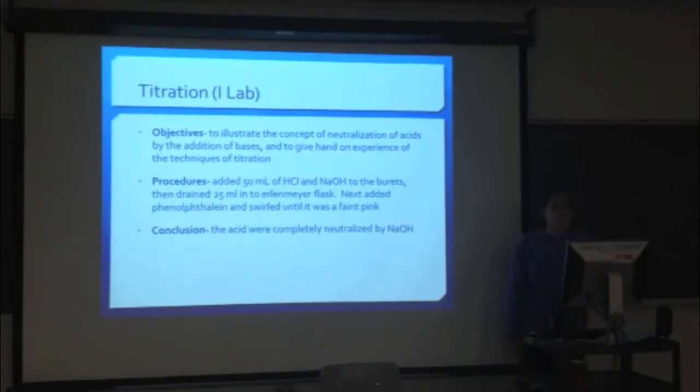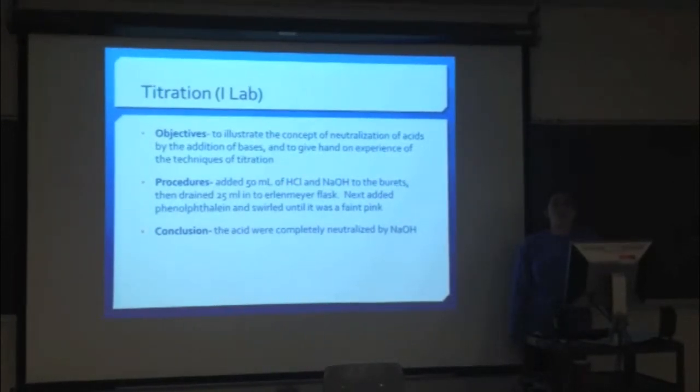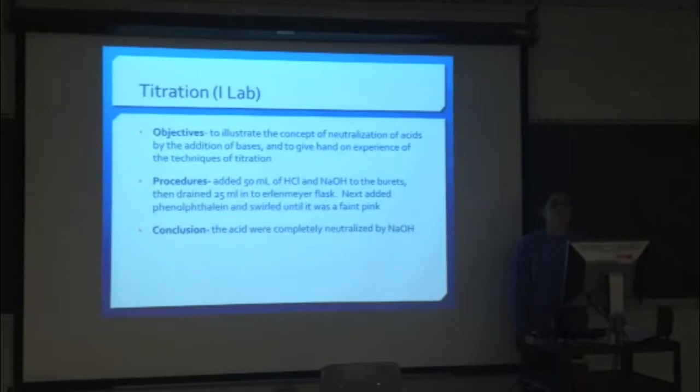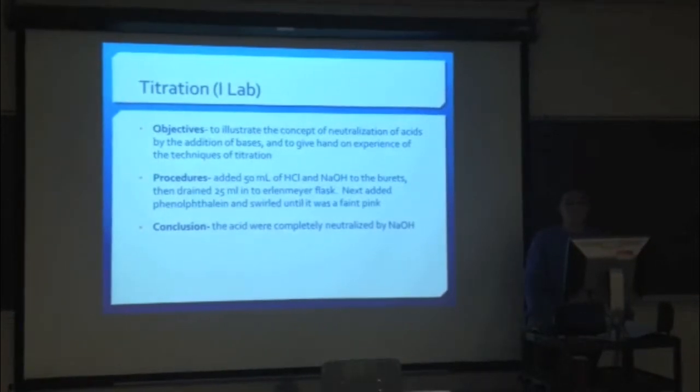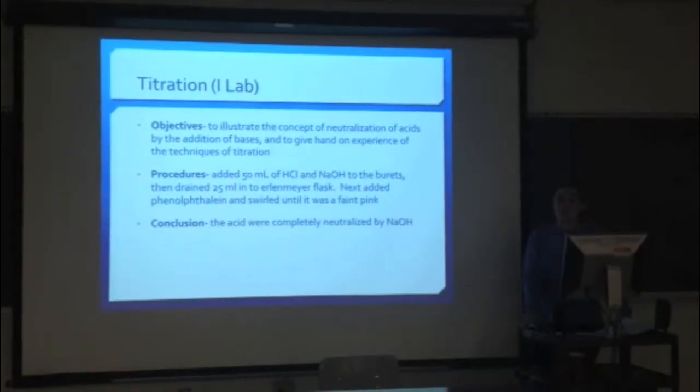The first lab was more of a run through because we hadn't ever done it before, so it was more like a warm-up for us for these upcoming labs. The conclusion of this lab was the acid was completely neutralized by NaOH.